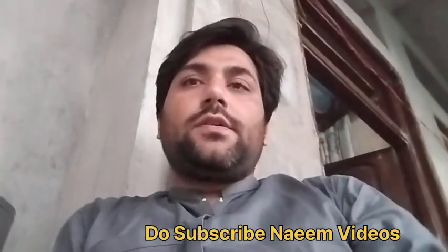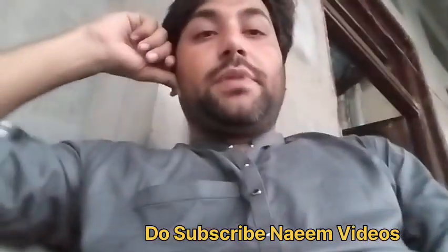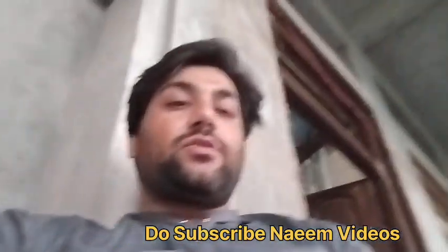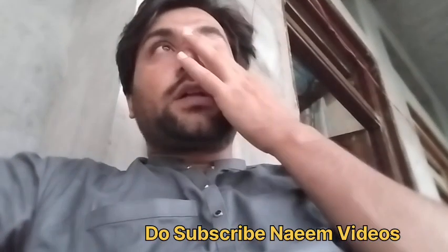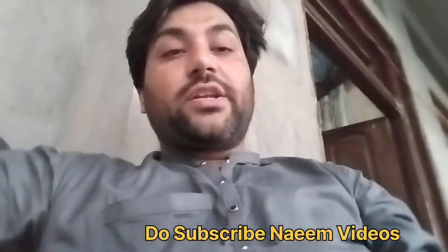Dear friends, dear viewers, here in this video I will discuss an amazing topic: the use of PPE, how you can use personal protective equipment. In the previous videos I had discussed standard precautions, isolation, transmission of infection, the chain of infection, and components of the chain of infection. But now in this video I will discuss the use of PPEs, personal protective equipment.